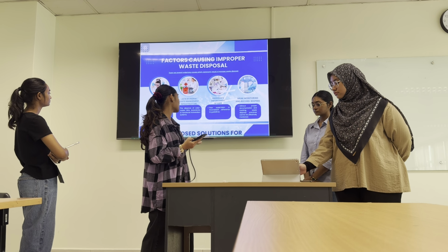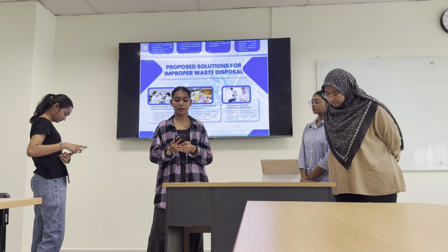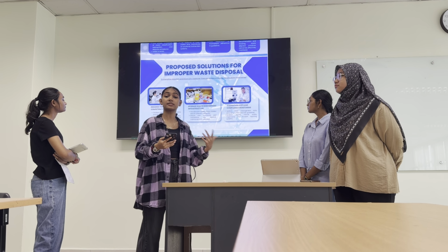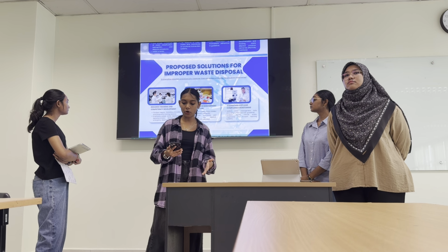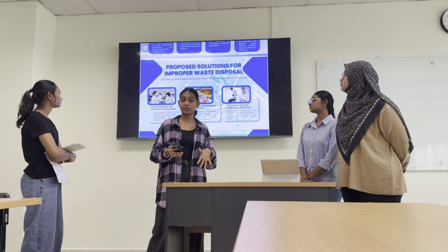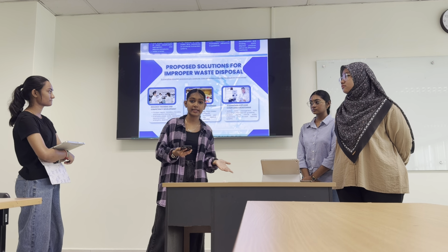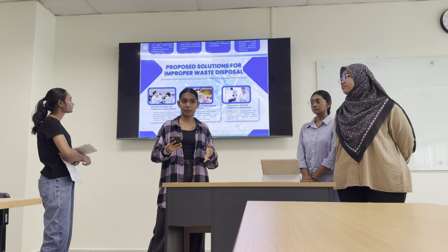Next, we move on to the proposed solutions. Okay, so in order to reduce the biosafety risk and to improve biosecurity, several corrective actions can be implemented. Firstly is to enhance training and competency development. Basically, we can conduct regular and mandatory biosafety training for all the staff in the lab. The training should cover waste segregation, decontamination procedures and also emergency response in case any emergency happens, for example bacterial exposure.